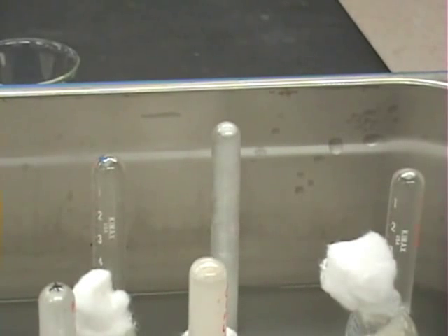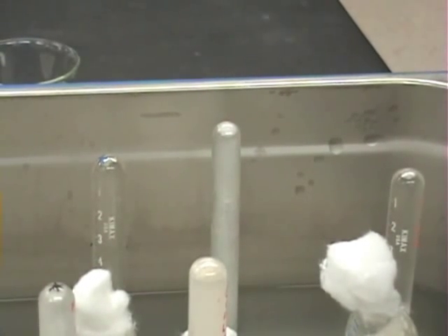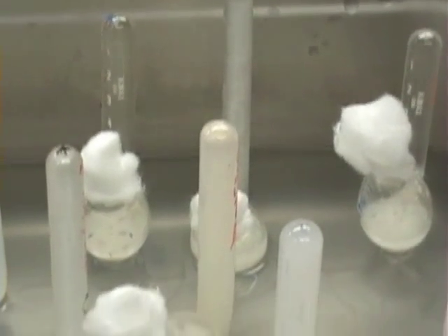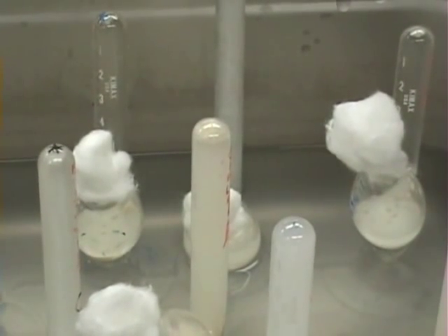A few minutes have elapsed and you can see there is already gas production in one tube, with the rise and fall of the yeast in the solution. In other tubes there is less fermentation occurring, if any at all. We'll check back in a few minutes.